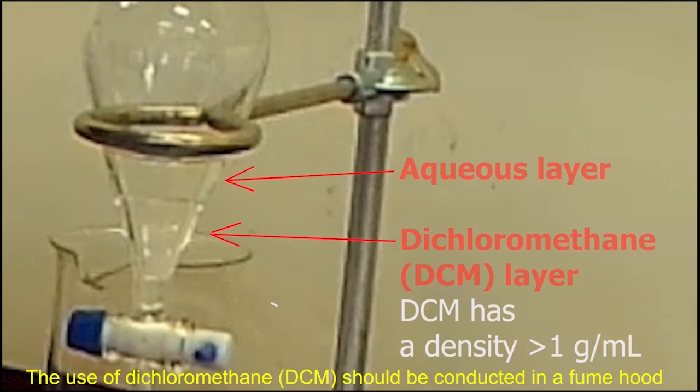For example, since the densities of halogenated organic solvents such as DCM are higher than that of water, DCM will rest on the bottom. So the water droplets will mix with the top layer.